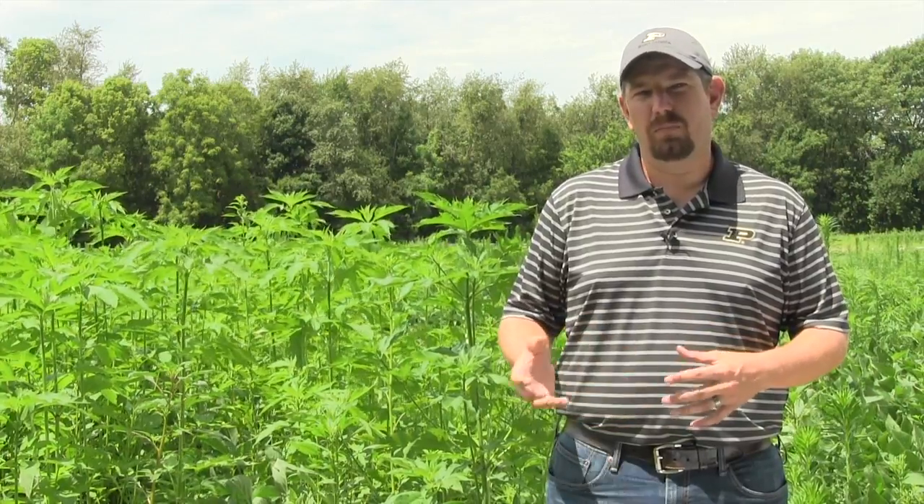The big thing with these leaf tissue samples is that we make sure we're getting the freshest material we can possibly get — that means the newest material as well as keeping it fresh from the field to when it gets to the laboratory. The quality of that sample plays a big part in the quality of the results that we can return to you.